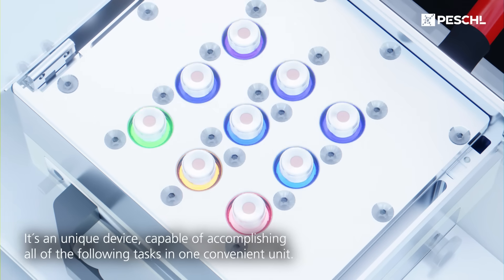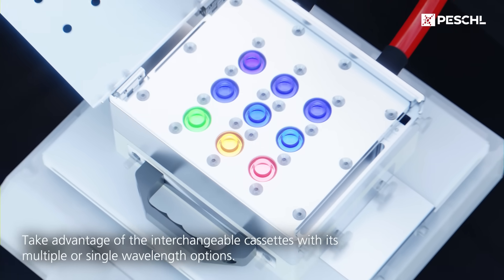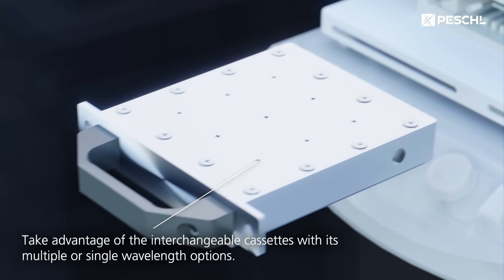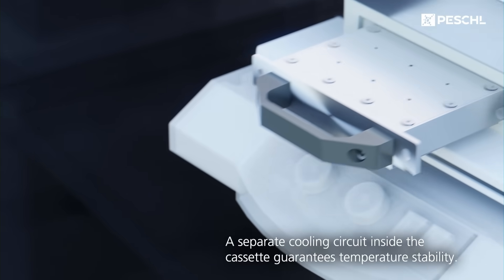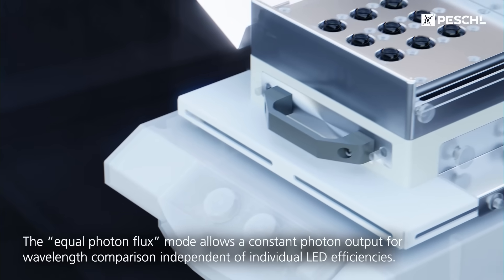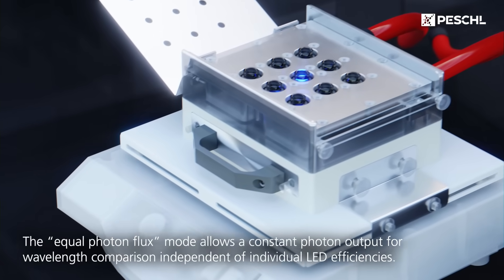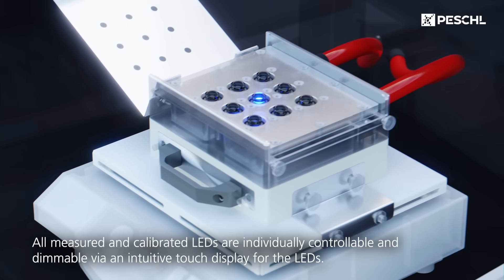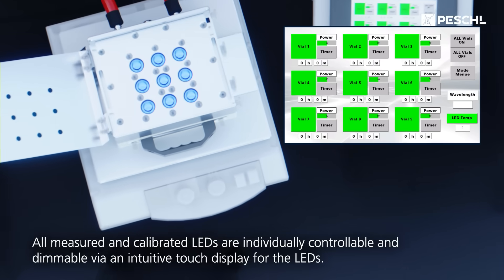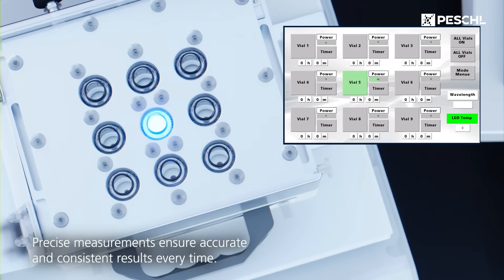It's a unique device, capable of accomplishing all of the following tasks in one convenient unit. Take advantage of the interchangeable cassettes with multiple or single wavelength options. A separate cooling circuit inside the cassette guarantees temperature stability. The equal photon flux mode allows a constant photon output for wavelength comparison independent of individual LED efficiencies. All measured and calibrated LEDs are individually controllable and dimmable via an intuitive touch display, ensuring accurate and consistent results every time.